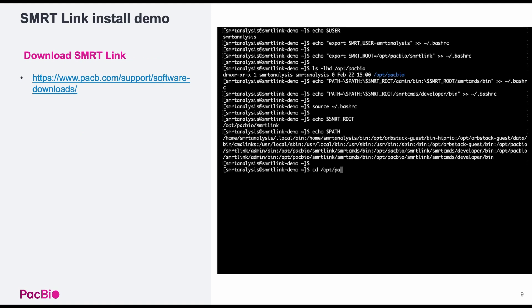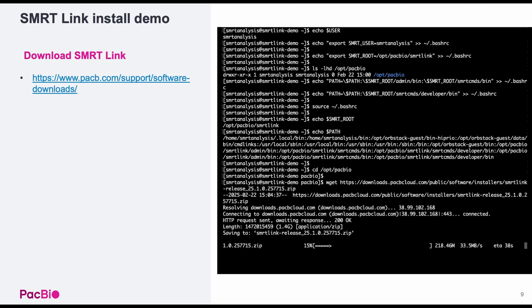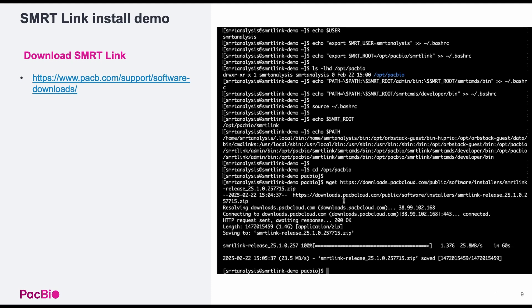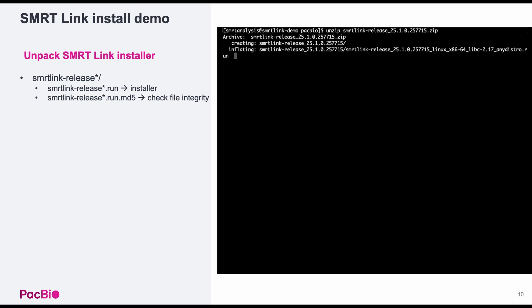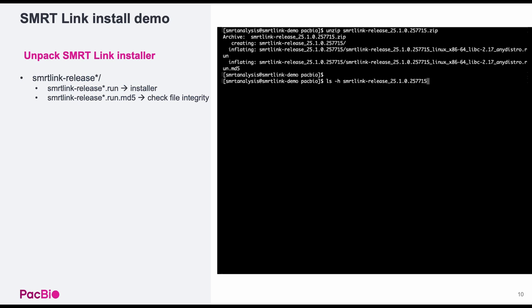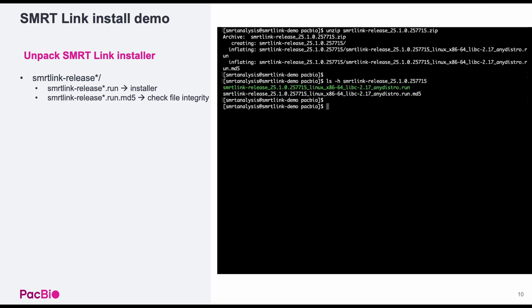All right, now we're ready to download SmartLink. Navigate to opt-pack-bio and then download the latest version, currently version 25.2, using wget. You can copy the download link from pacbio.com/support/software downloads. Now let's unzip the file and take a look at what's inside. Inside, we'll find the .run installer file and the MD5 file to optionally verify that the file's contents are intact.